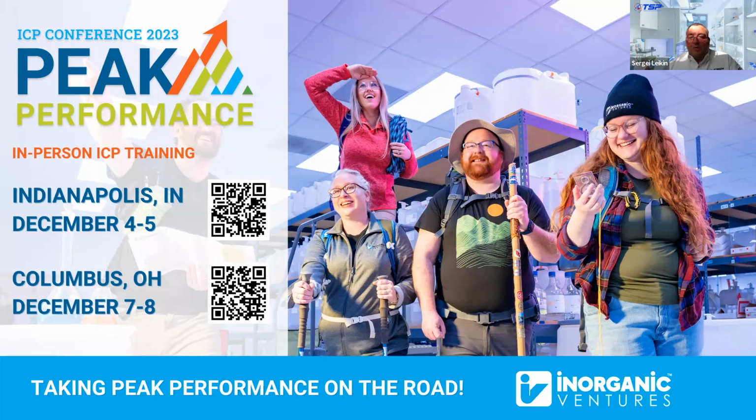And the other example, people now are looking at running the actually disposed oils to rework them and get biodiesel or things like that. So the raw material for that is this greasy oil that is collected from places like Burger King's, McDonald's, and everything. So that's a pretty nasty sample. And of course, it's not going to match exactly the standards in oil, but that's a pretty close estimation. And the analysis is actually being done quite well on that.